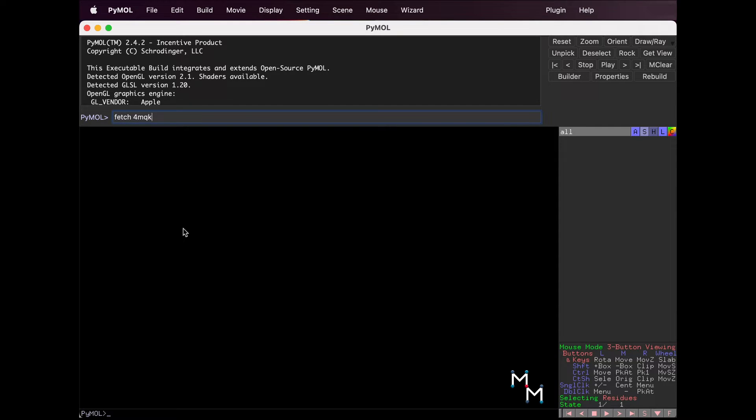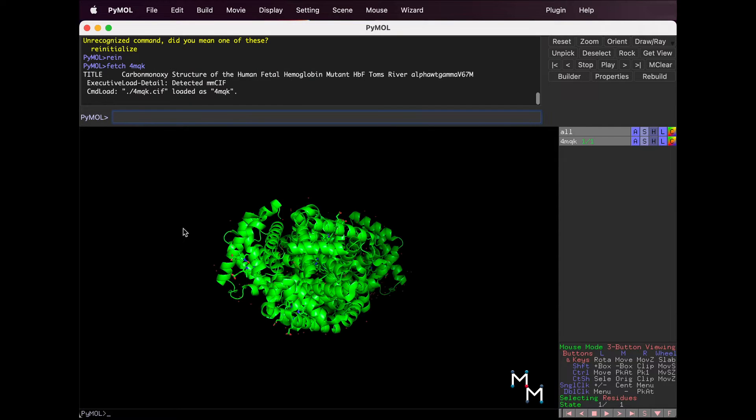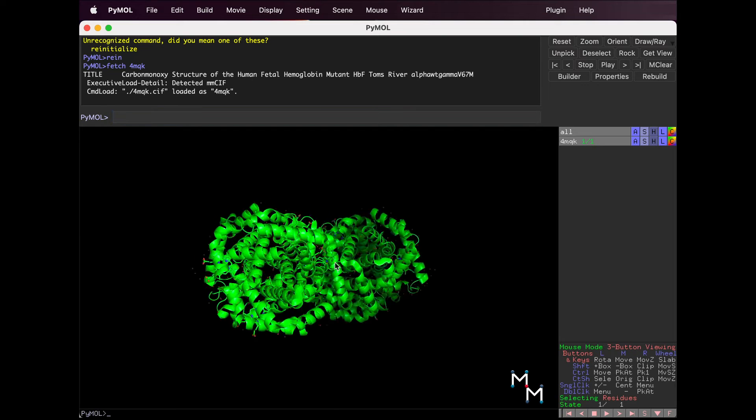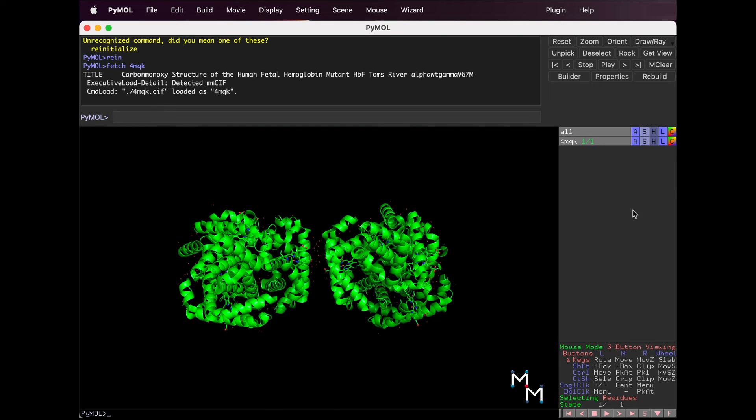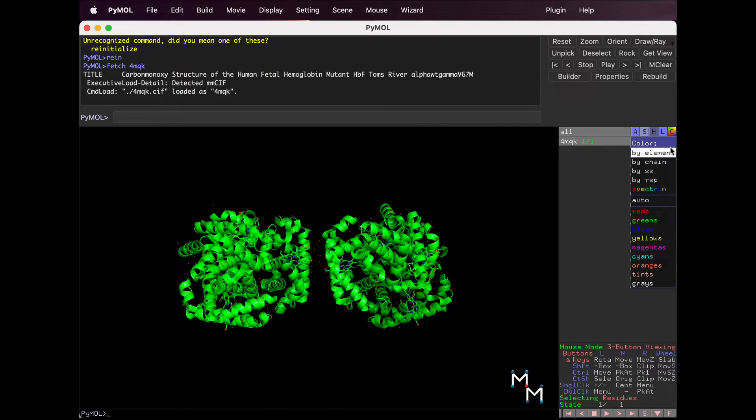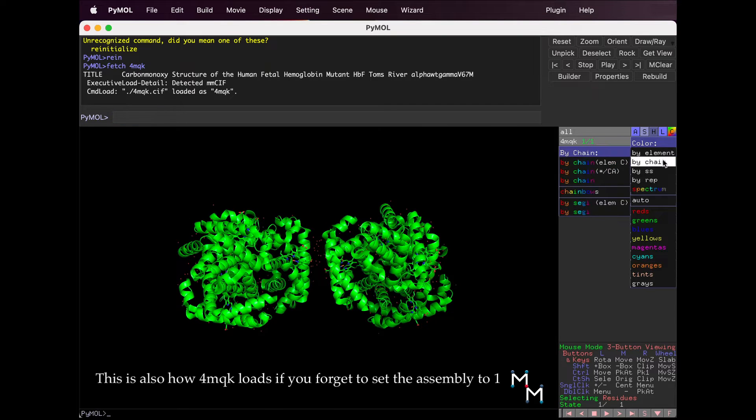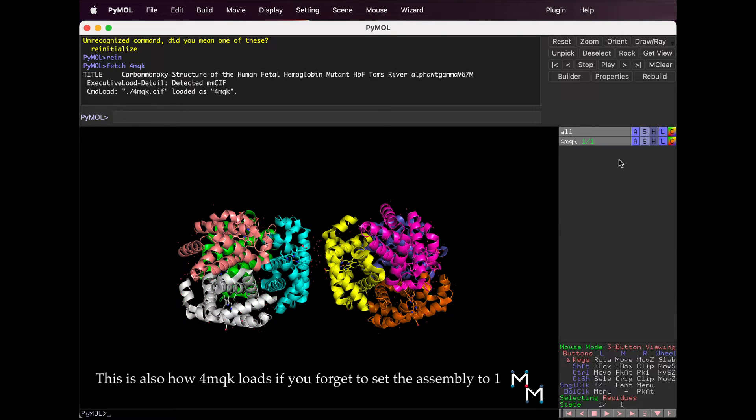But when we do this with 4MQK, we see eight chains.